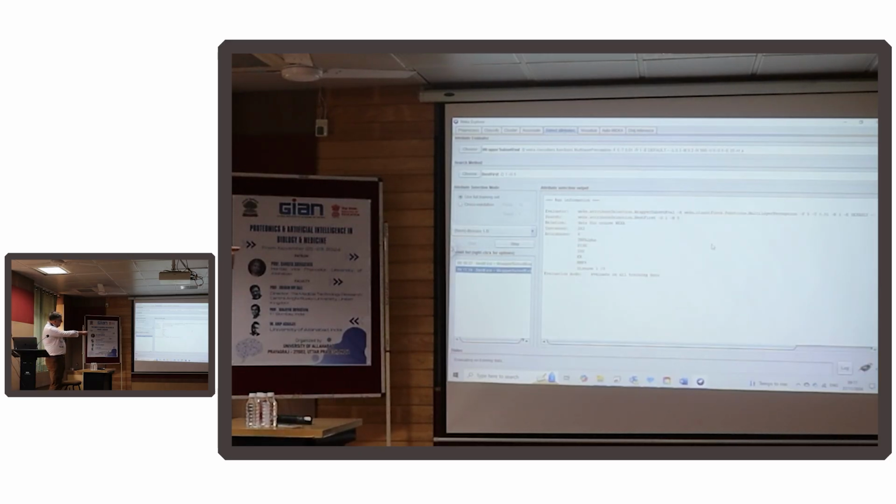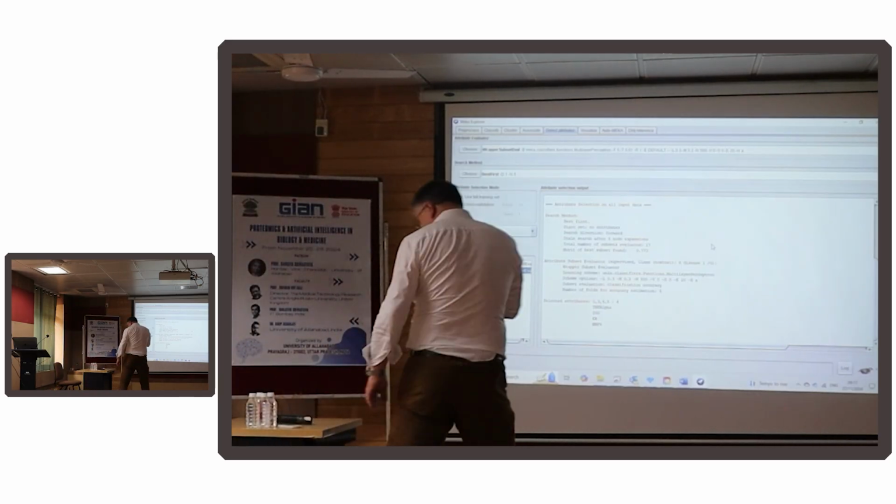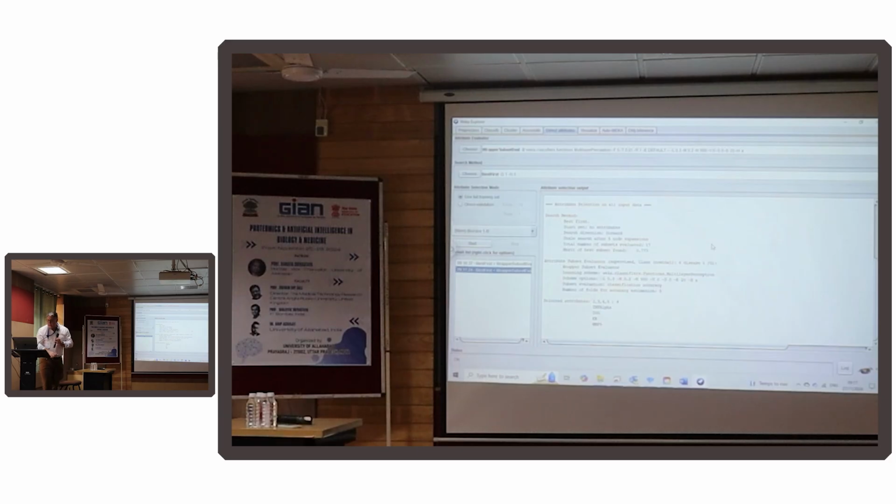When we know it's running, we can see the Weka bird moving at the bottom there. It's put 6 inputs forward. It's predicting disease versus healthy. So it's taking a little bit of time because it's doing thousands and thousands of calculations. And now it's identified the 4 best attributes as TNF alpha, IgG, ER, MMP9. So it's searched through all those combinations, and those are the 4 best ones that it's found.